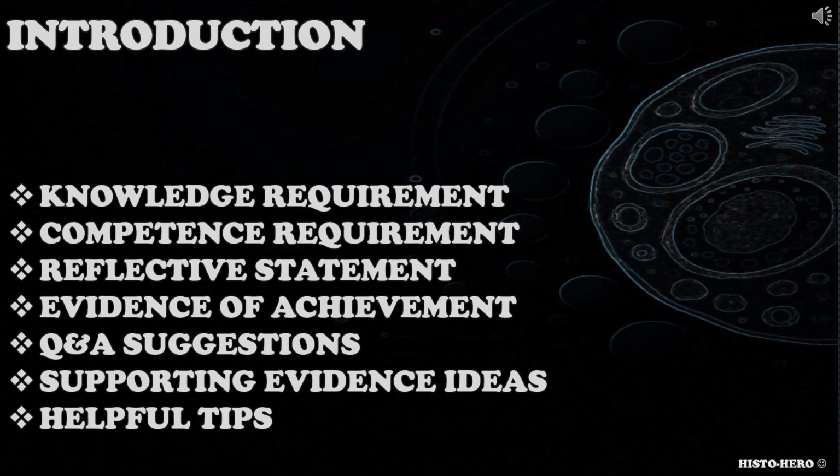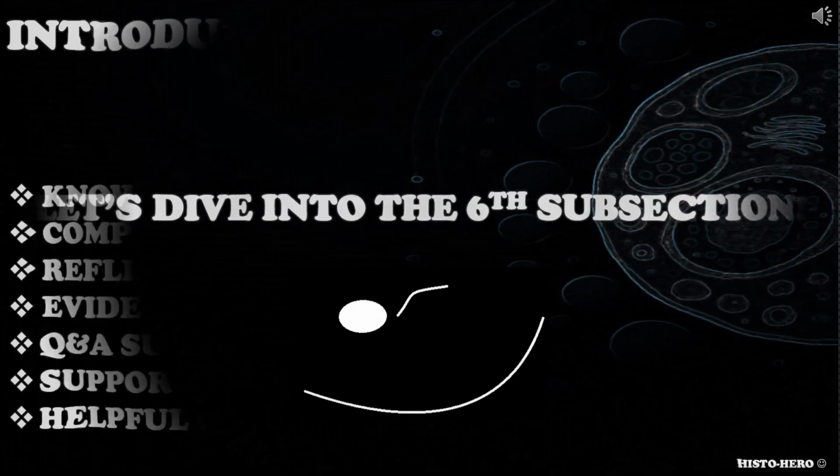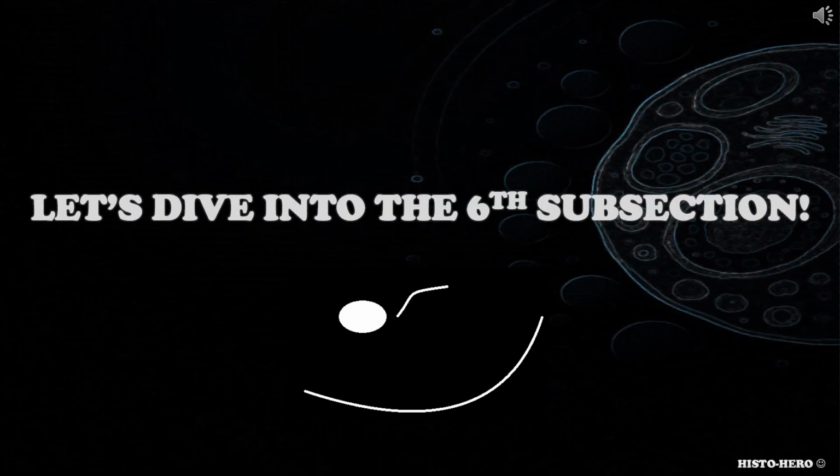I will discuss knowledge requirements, competence requirements, reflective statement, evidence of achievement, Q&A suggestions, evidence ideas, and some helpful tips to make candidates' portfolio really good. With all that said, I hope you will enjoy the content of my video and I hope you will learn a lot. So let's dive into the sixth subsection of the first section, tissue preparation techniques, cryotomy.